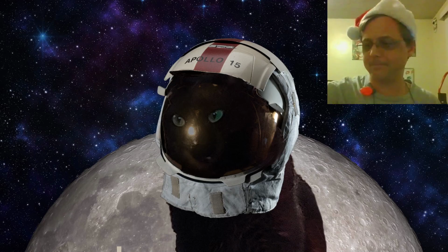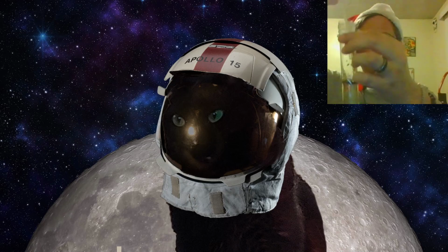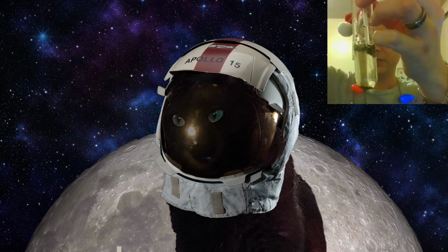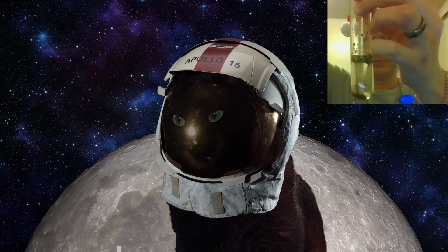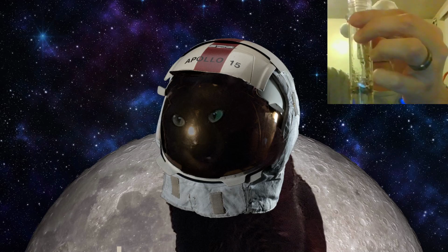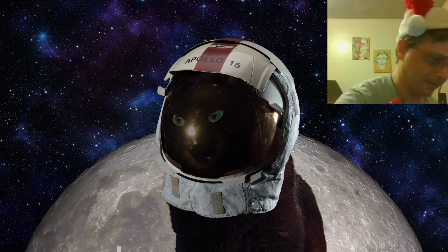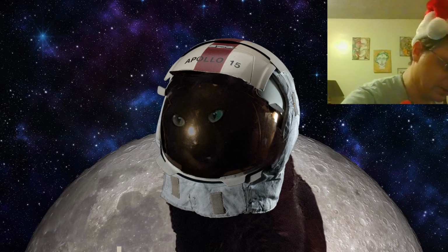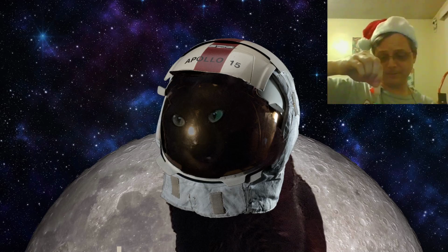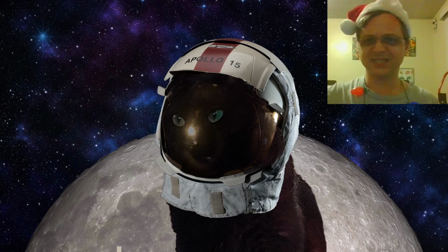Try to get something off the bottom. And last time I stirred it up by blowing air in there. This time I'm just gonna try to get something. Still kind of stirred it up, but I was trying to get something off the bottom here. But hold on. There's lots of material in this dropper. Oh yeah, there's a lot of material in here. Spread it out a little bit. Okay. Alright. Probably gonna find more of these little nymphy bugs. Gnats.